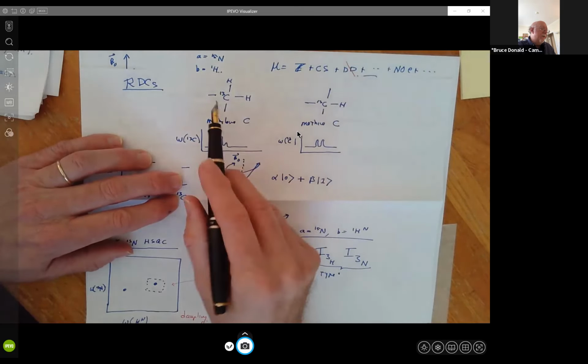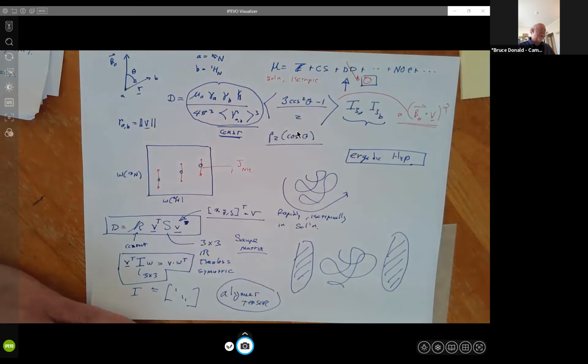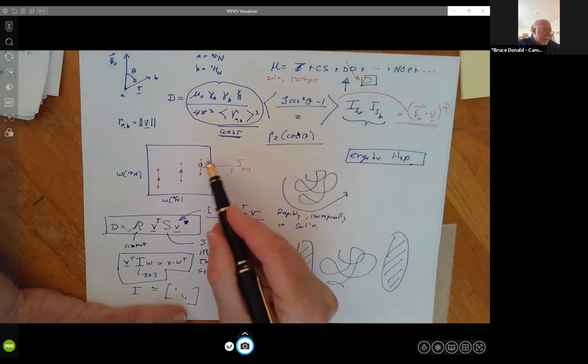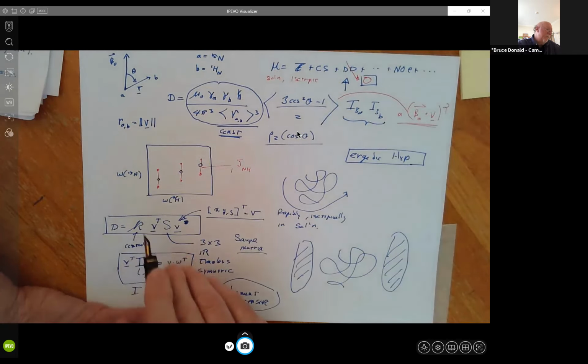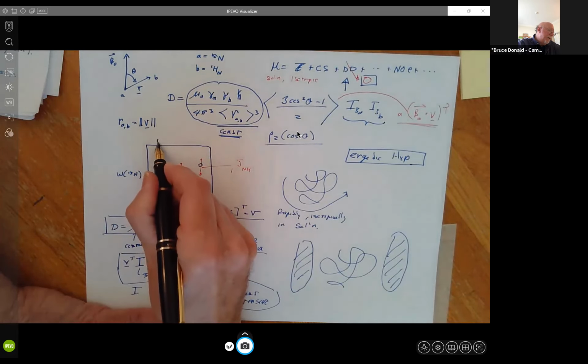There is a process to get rid of that, but that's not part of this. So this process is not called decoupling, it's just called averaging. So that doesn't collapse anything here. You're still going to see two different peaks here, the two red peaks. But one way I can explain this is as follows. So here's the spectrum unaligned.